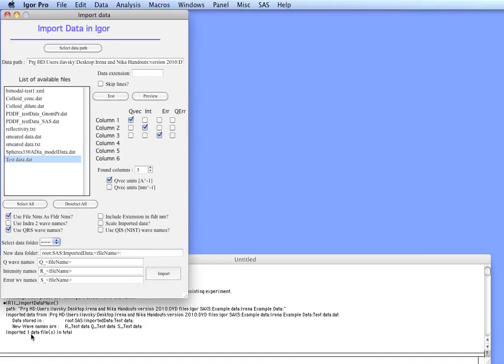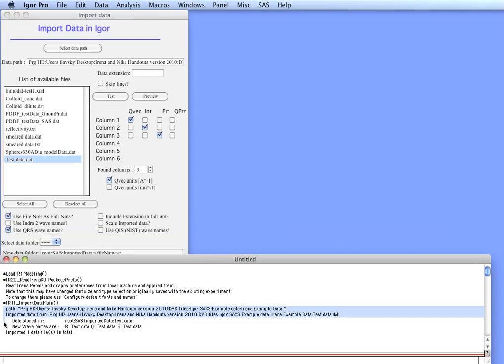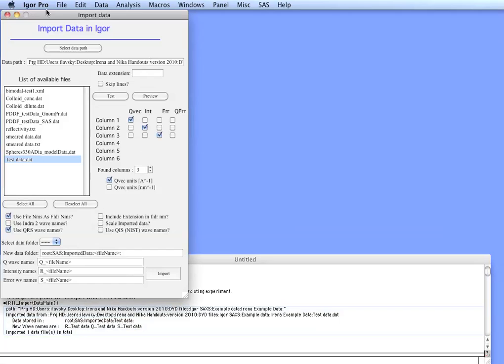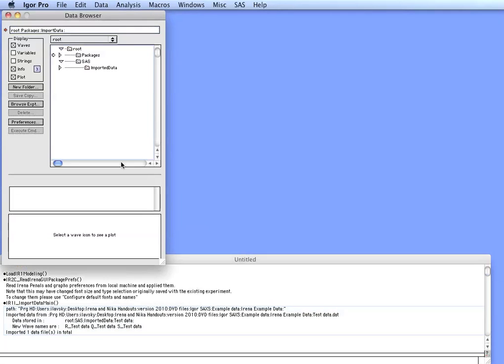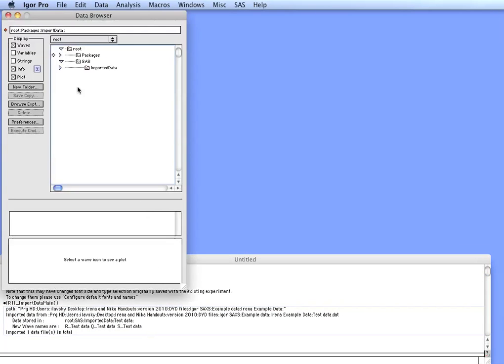Down here in the history area you have described what was imported and where. So now in IRENA we have a folder which was created for us, SAS imported data, and this is the name of the file. Inside are three columns of data: Q, R, and S intensity and error.